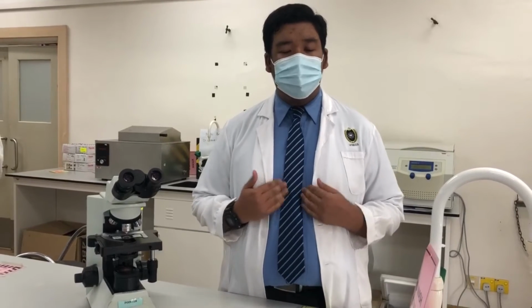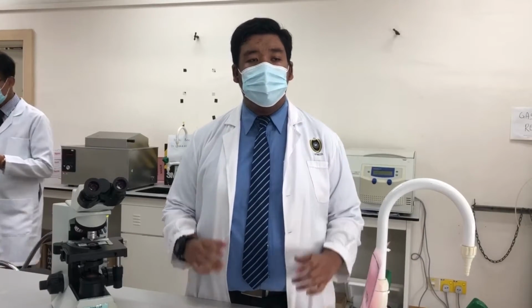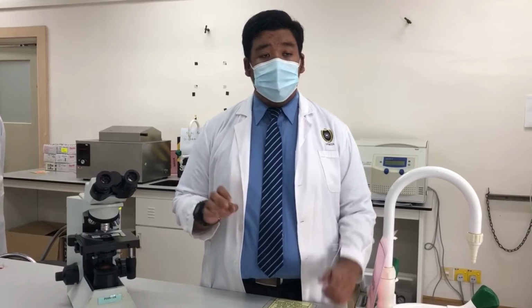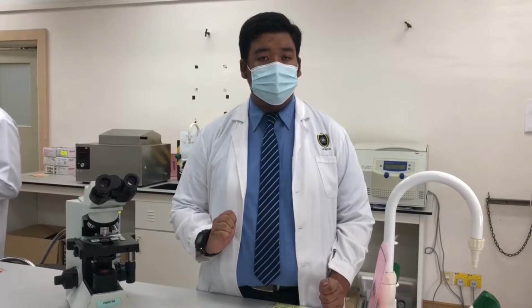My name is Muhammad Ishaq Shafiq bin Abdul Rahim and I will start the introduction about microscope. What is a microscope? Microscopes are instruments that are used in science laboratories to evaluate very small objects such as cells, microorganisms and give a contrasting image that is magnified. Microscopes are made up of lenses for magnification, each with its own magnification power. Depending on the type of lens, it will magnify the specimen according to its focus strength.